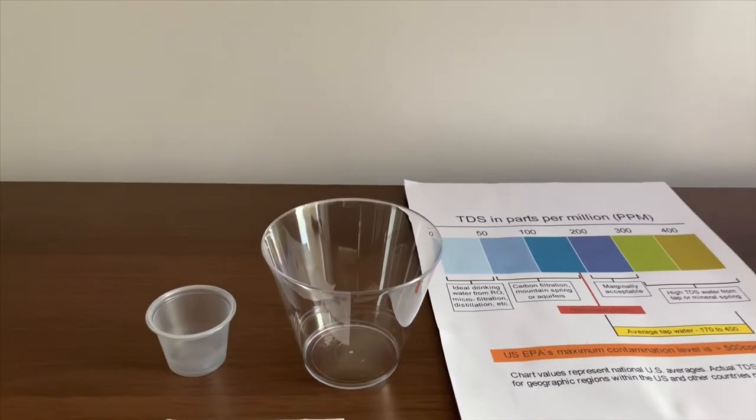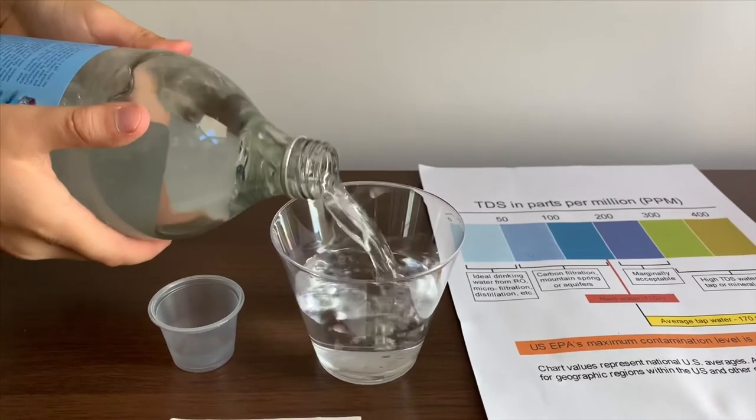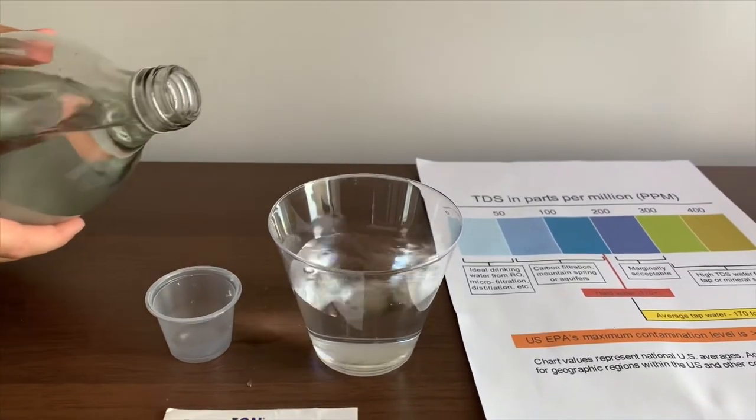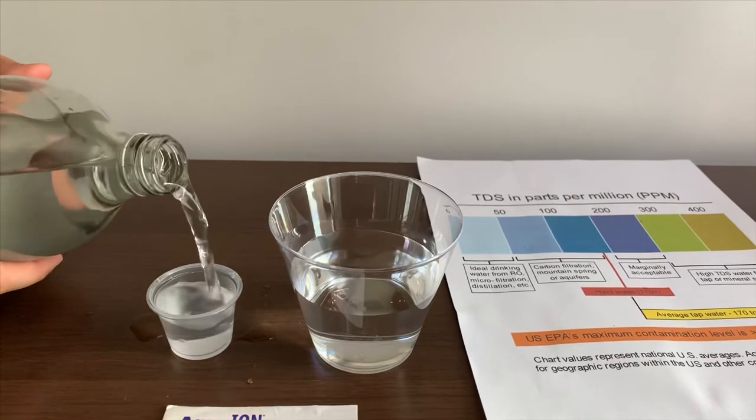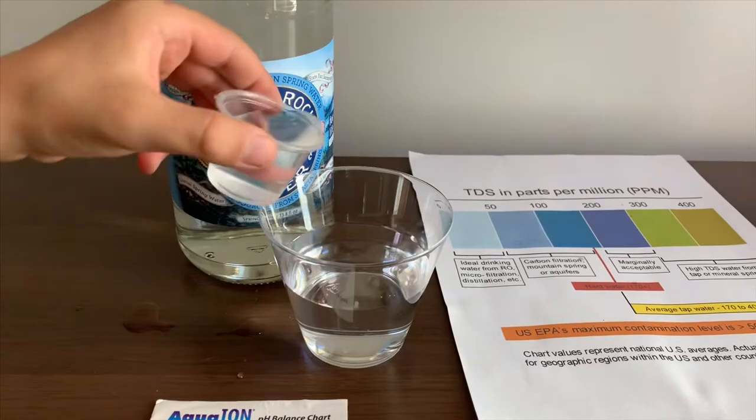Let's pour some water in. This is a little too much for the pH. Let's pour some back in the TDS.